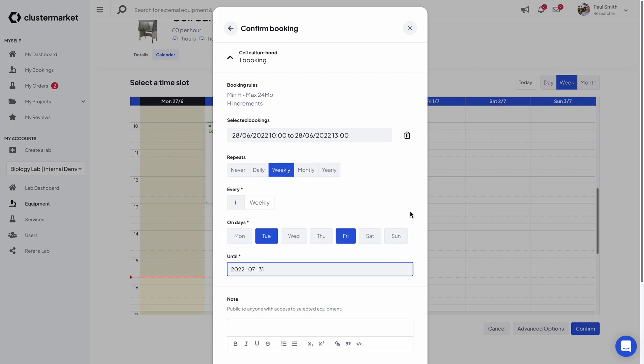So essentially what I'm saying is that the cell culture hood will be available to me from 10 to 13 every week on Tuesdays and Fridays.